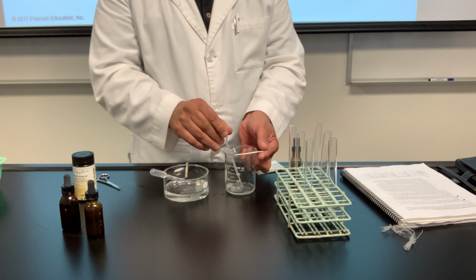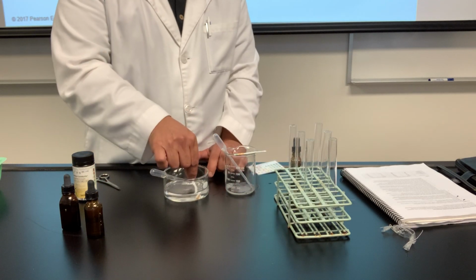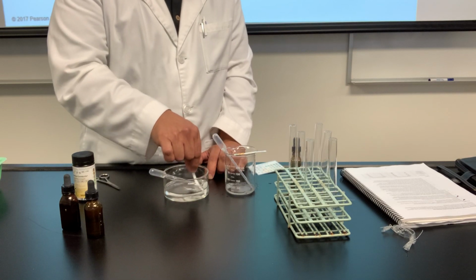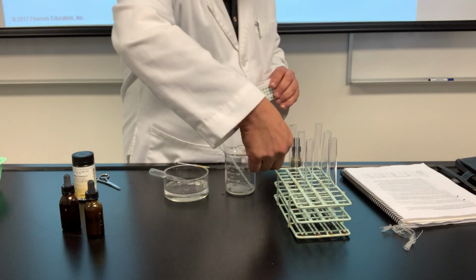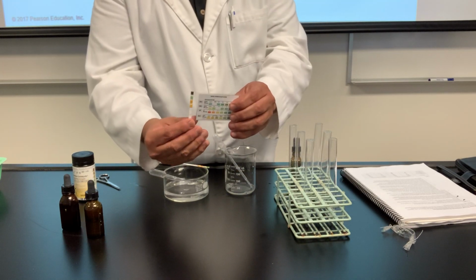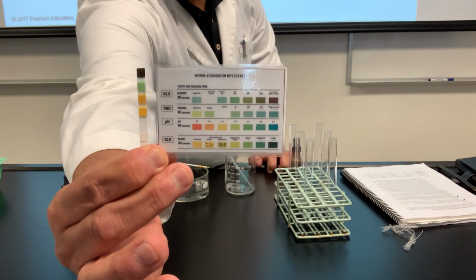Okay, and let it sit for a little bit. And this one, I can simply go like that, right? Dip it in there. And that's gonna be my outside. Good. It already had a chance to react. Now we can take it and look at it like this. You see that? I'm kind of going towards the camera.